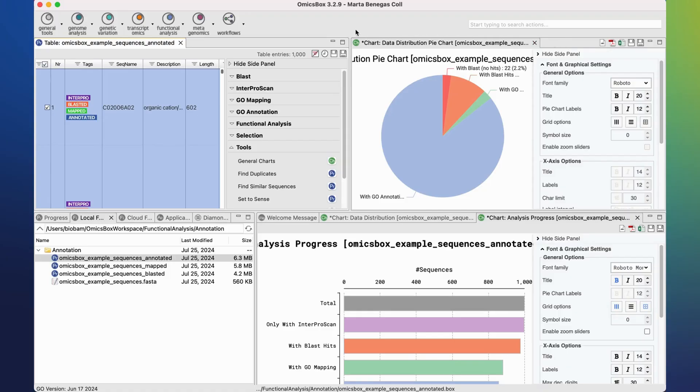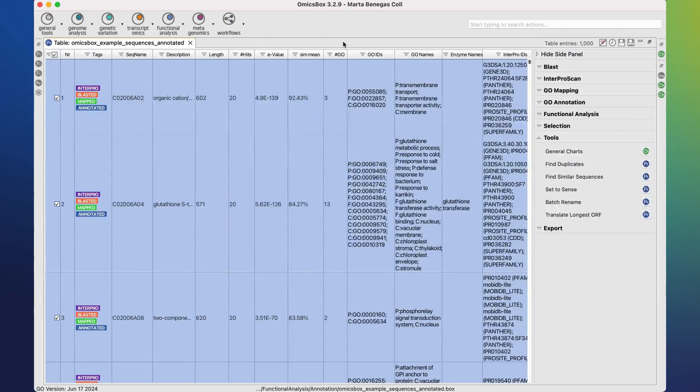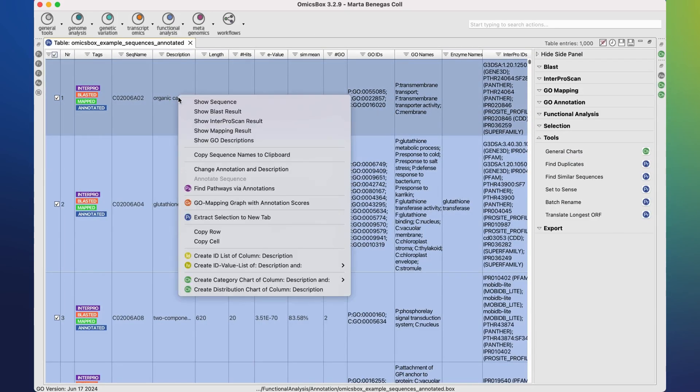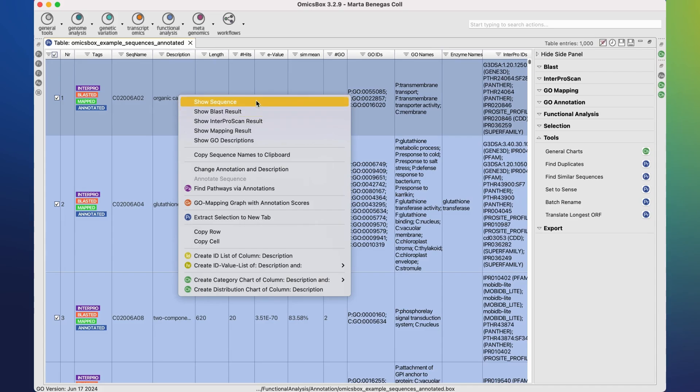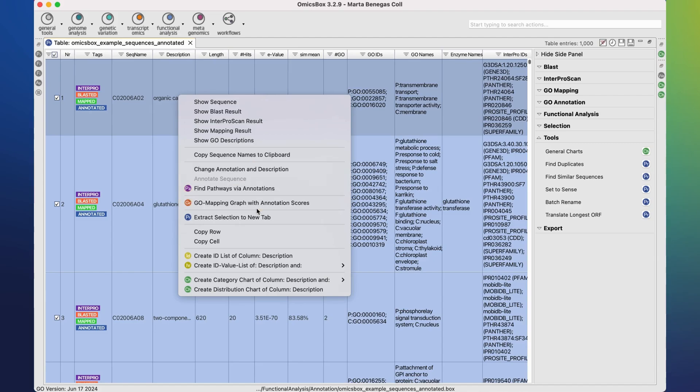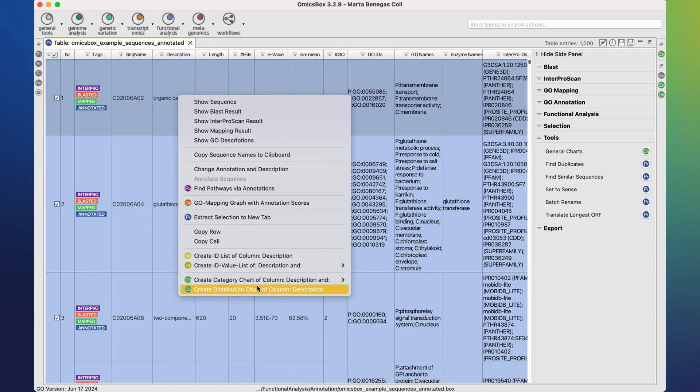Finally, the main results table has some context options as well. A context menu is open if we right-click on a given row. The tools listed at the top are specific for this type of analysis, whereas the ones in the bottom are common to any OmnisBox project.